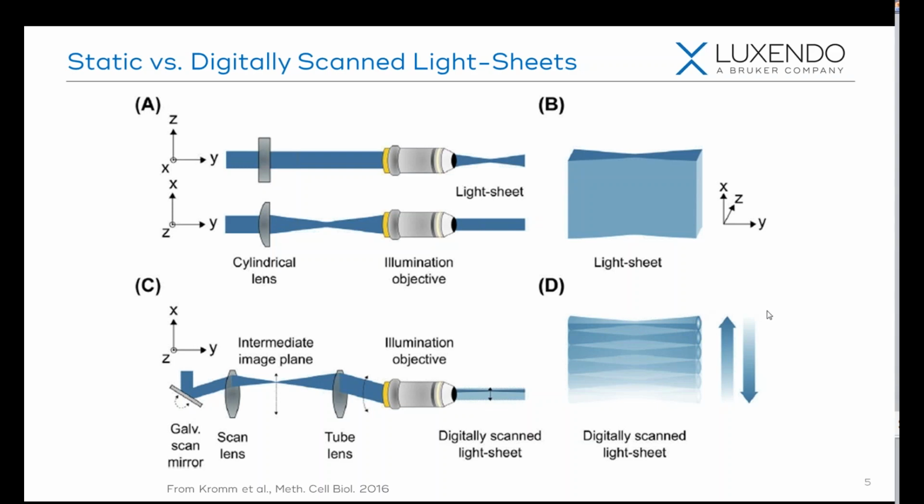And so there's been a lot of recent work towards using non-diffracting beams, such as Airy beams, Bessel beams, or a lattice of Bessel beams, as made popular by Eric Betzig's lattice light sheet microscope.